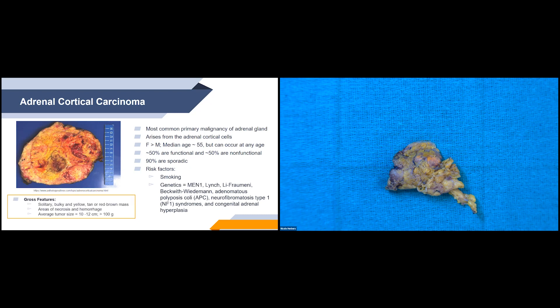Gross features for adrenal cortical carcinoma: they're typically solitary, bulky, and yellow, tan, or red-brown masses. They typically have areas of necrosis and hemorrhage, which you can see on the image. The average tumor size is about 10 to 12 centimeters, and these masses tend to be over 100 grams.